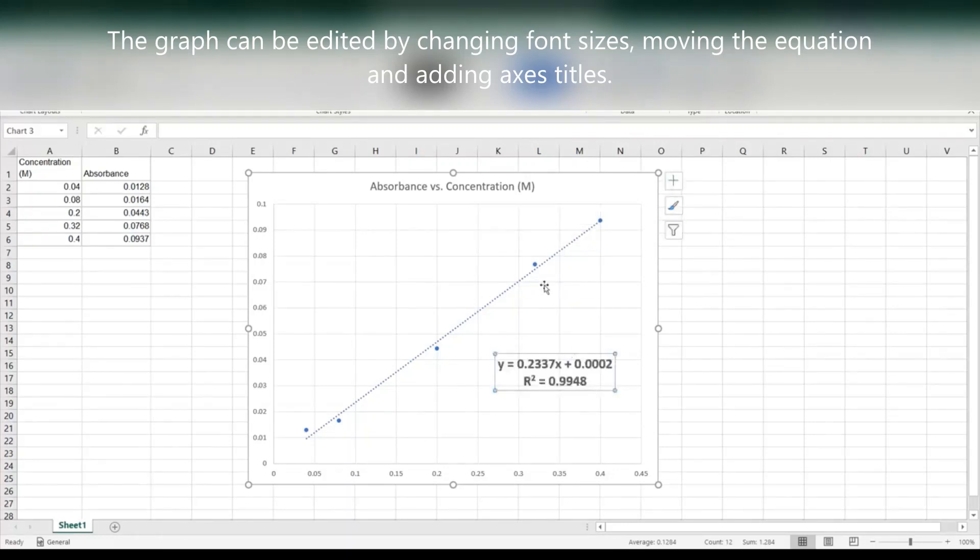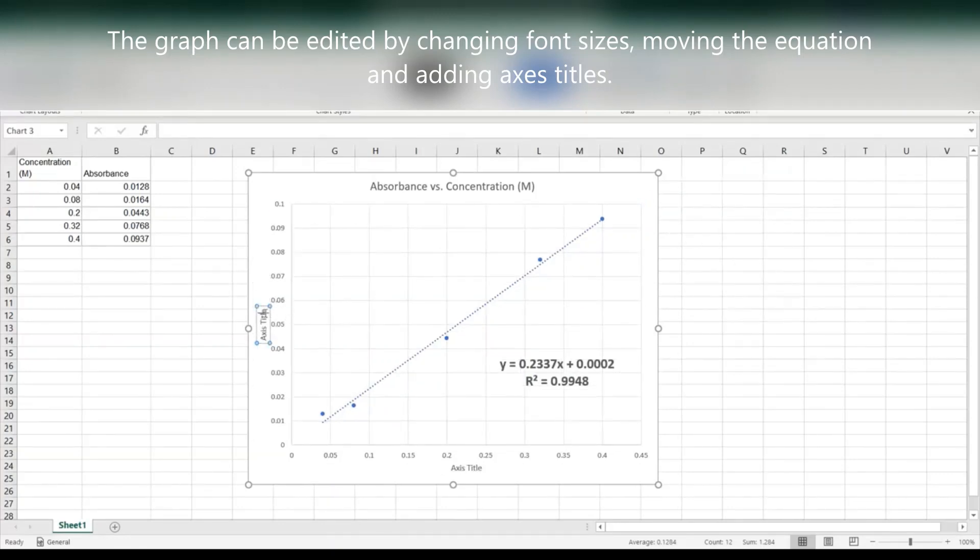Now I'll go ahead and edit the axes titles on the graph. So for the y-axis we want to use absorbance that was the dependent variable in the experiment. The x-axis the independent variable will change to concentration which was measured in units of molarity.